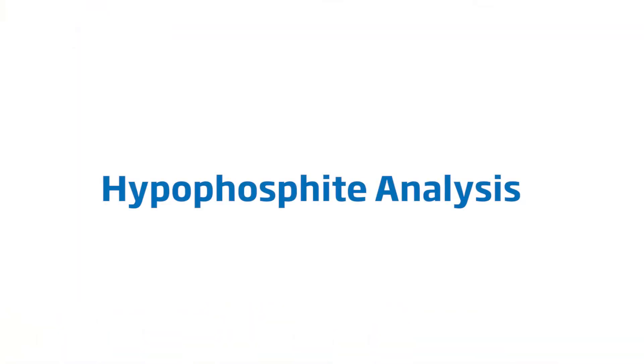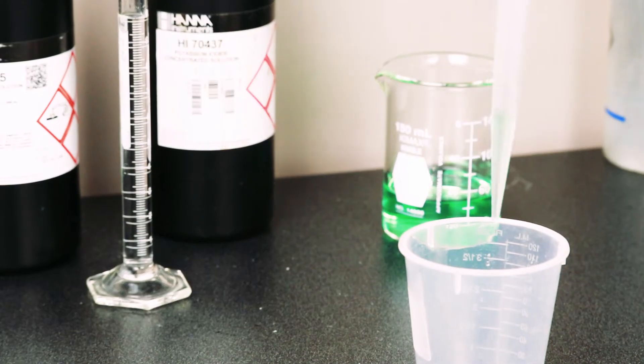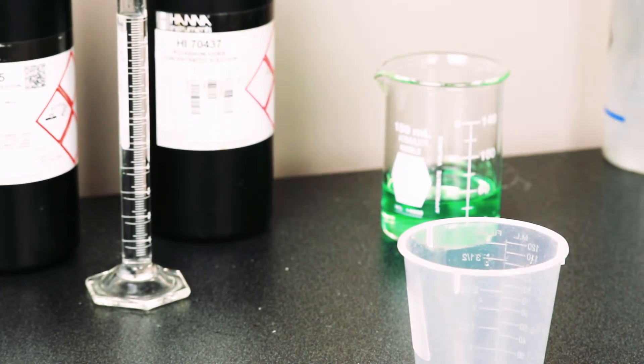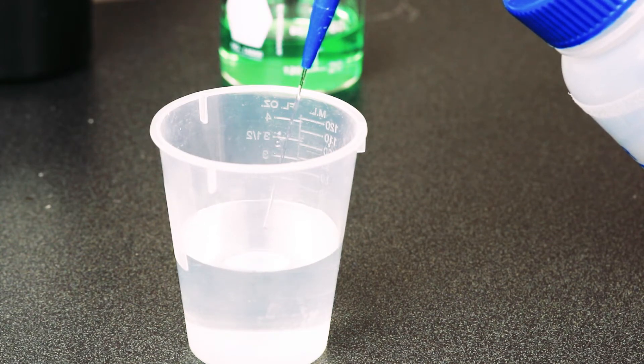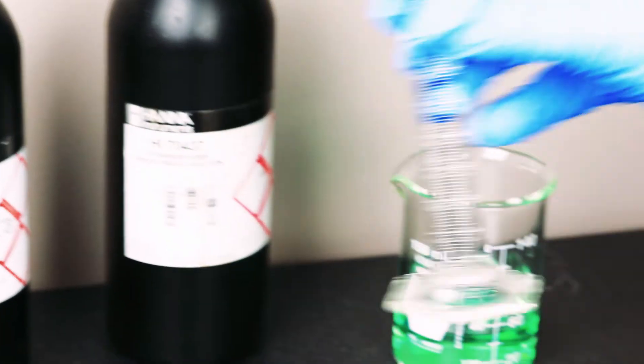Finally, the Hanna HI902 automatic titrator can measure hypophosphite content in your electrolyte bath. This procedure starts by taking a sample with enough deionized water to submerge the electrode and adding 10 milliliters of sulfuric acid to it.